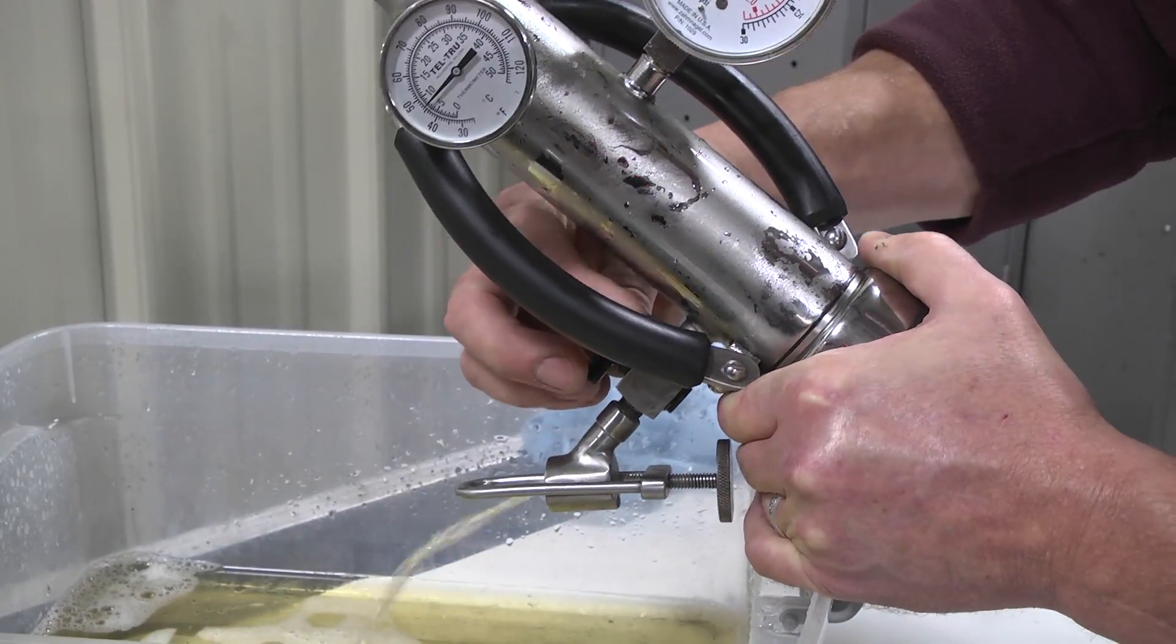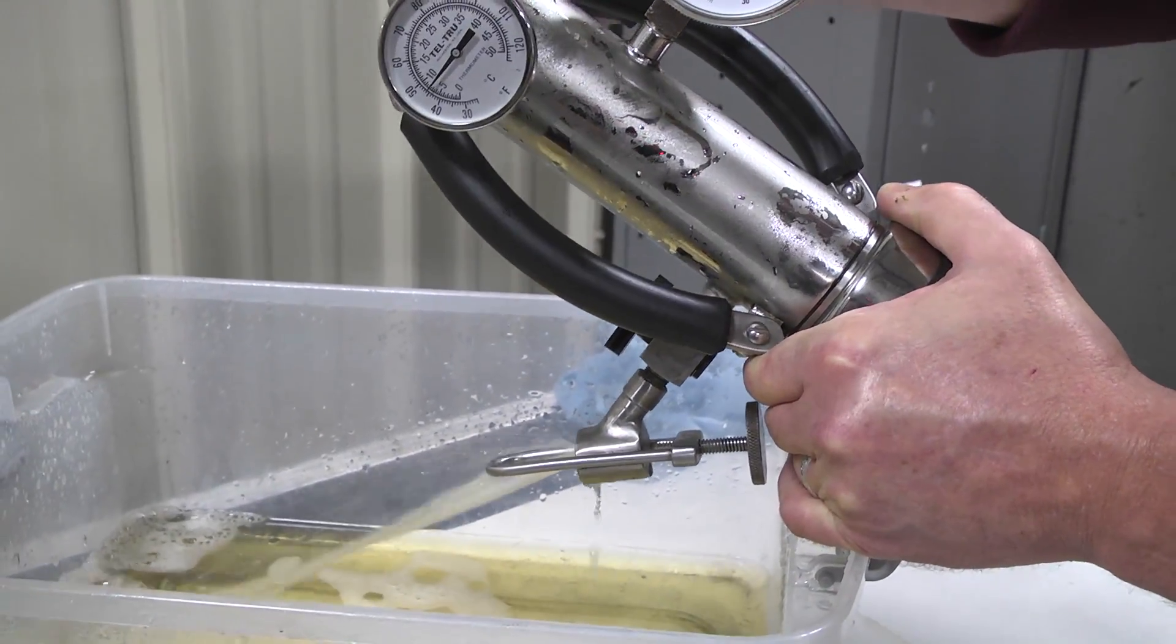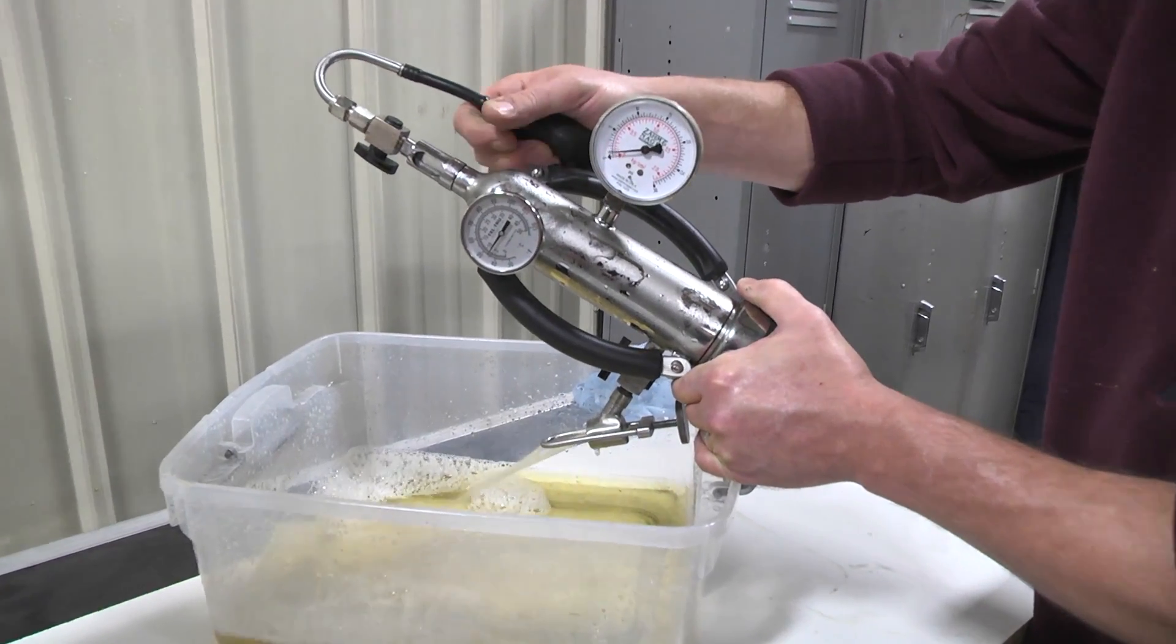After the test has been completed, open both inlet and outlet valves and blow out the beer sample with pressure from the aspirator.